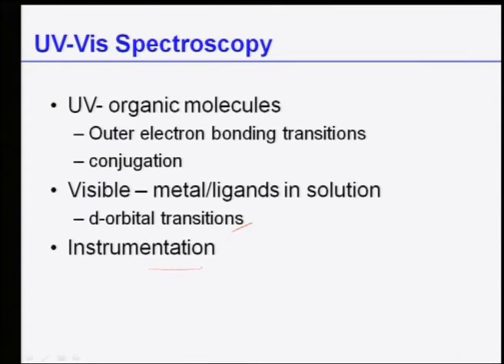So to give you a better idea, UV spectroscopy is routinely used in many analytical chemistry labs. If you just walk into many analytical chemistry labs, people use this nowadays. In fact, in material science also, people who study different kinds of nanoparticles in solutions use UV visible spectroscopy extensively. And we can do both qualitative and quantitative study.